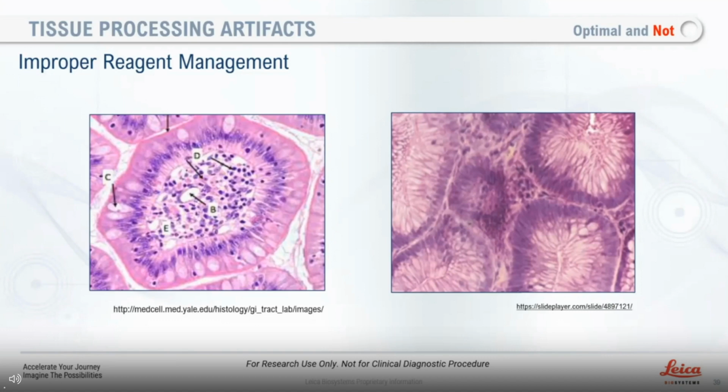So if you lowered your Venetian blinds and opened them a little bit, you have a kind of thick, thin step. You'll have a band that's darker, then a band that's lighter right above it, and it just follows repeatedly after that. That's what we consider chatter because the section is not even. It's not going to be that nice 4 to 5 microns all the way across. And that's when you get the light and dark staining alternating. And that's what we call chatter. And that's usually over processed.